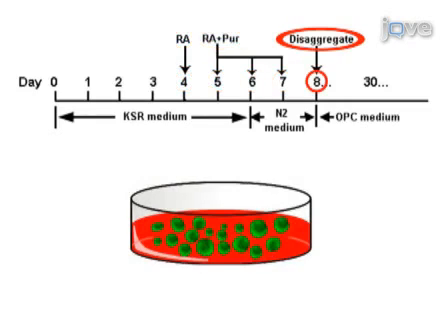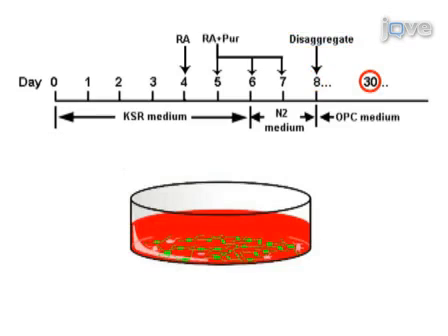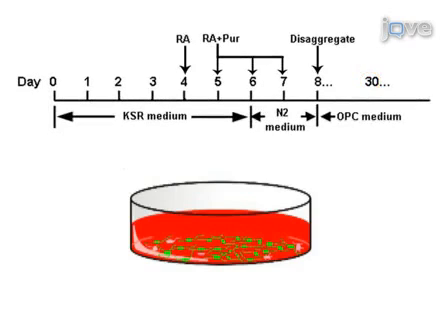As a third step, embryoid bodies are disaggregated into single cells. After an additional 22 days in culture, approximately 80% of the cells are OPCs. Next, the mESC-derived OPCs are transduced with baculoviruses carrying the NaV1.2 subunit in order to generate spiking OPCs. Results are obtained that show the expression of OPC markers and spiking properties of these mESC-derived OPCs based on immunofluorescence microscopy and electrophysiological recordings.